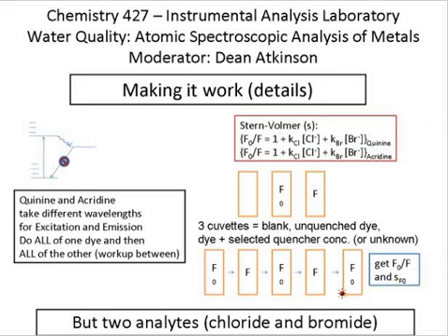There are 2 different standard deviations that you can calculate here. You can calculate the standard deviation within a set. You can also calculate the standard deviation for all of your samples. The one is sort of an overall long-term uncertainty or long-term drift of the system. The more applicable one for the calculation that we'll be doing here are these F naught within a single set of 5. One last caveat about these cuvettes.